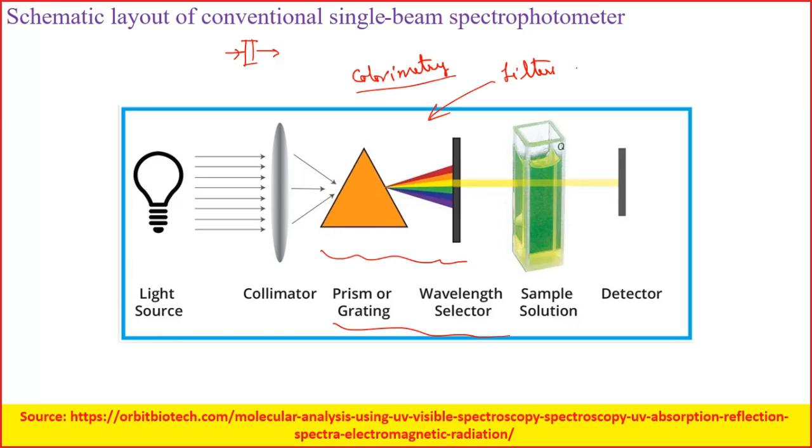So that is also a monochromatic absorption analysis, but you can use a series of filters within that system, and just by manually changing them you can record the absorptions at different wavelengths, and that system is regarded as colorimetry. Okay, so this is the layout of a single beam spectrophotometer, and similarly, as I told you, with slight changes we can have a colorimetry system also.